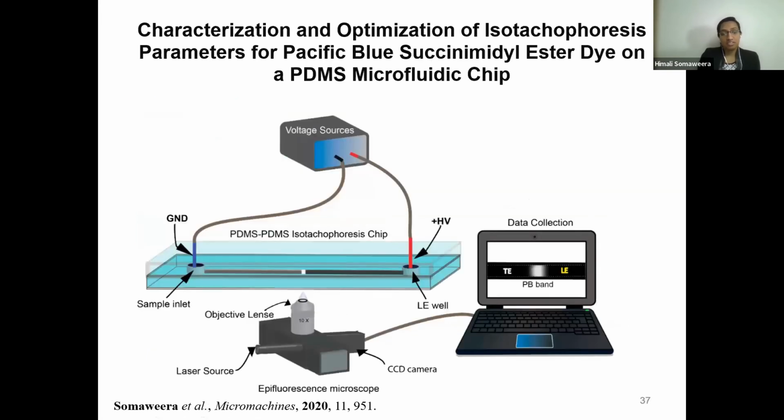So what I did in my postdoc study is the characterization and optimization of ITP parameters for the Pacific Blue Succinimidyl Ester dye, because it hasn't been used with ITP.